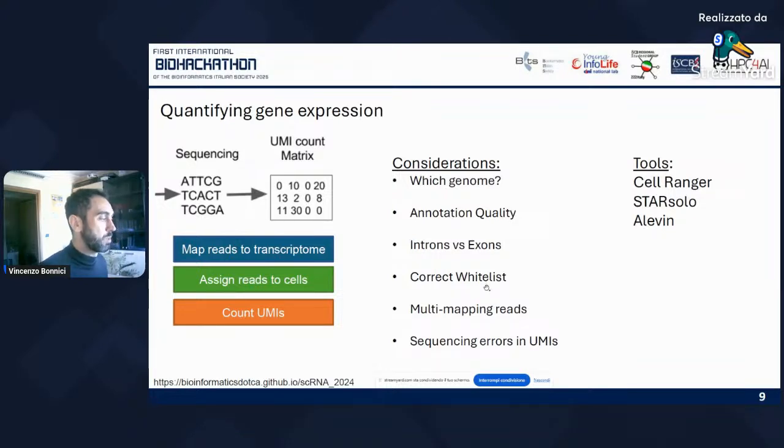We don't want to get the expression with that transcript, but it's the primary mapping for some of our reads. But for these reads, we also have the secondary mapping with almost the same quality in another part. We say it should be better.